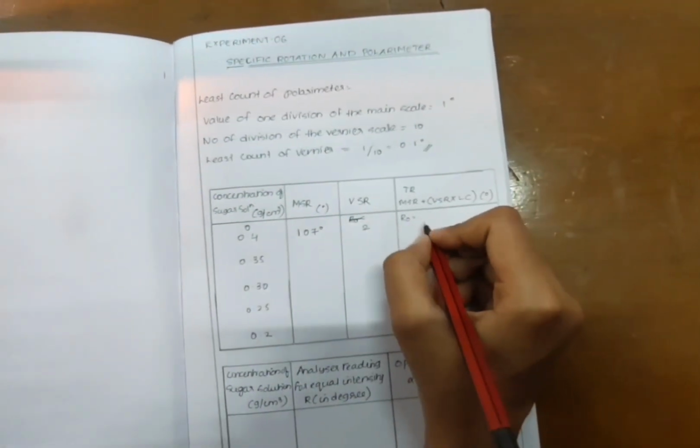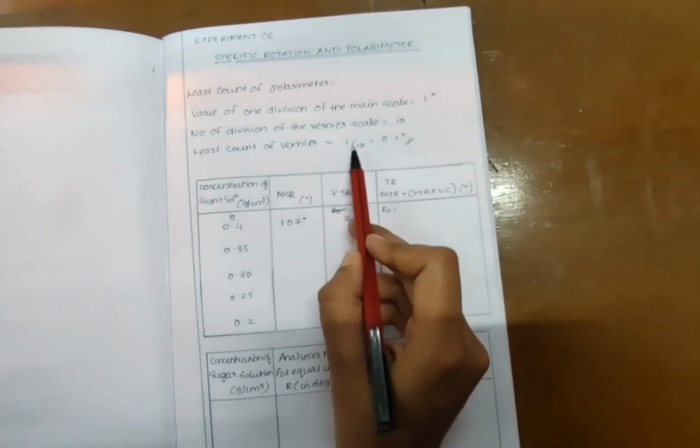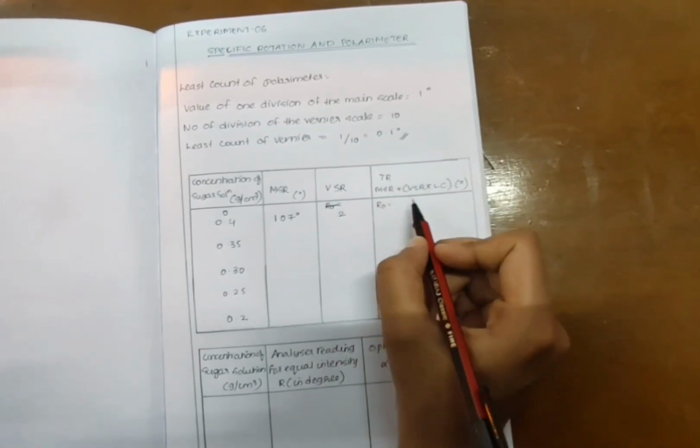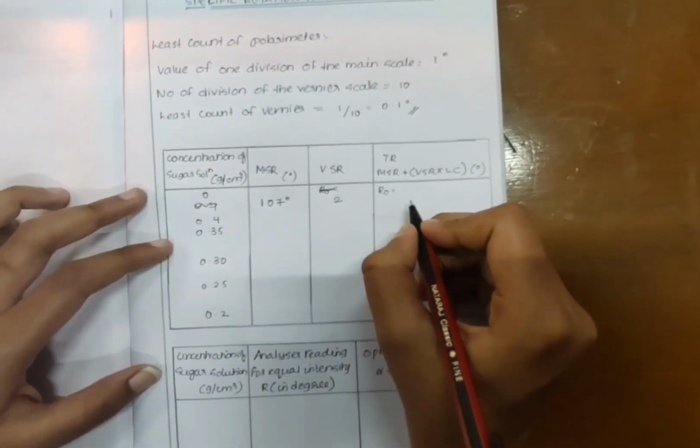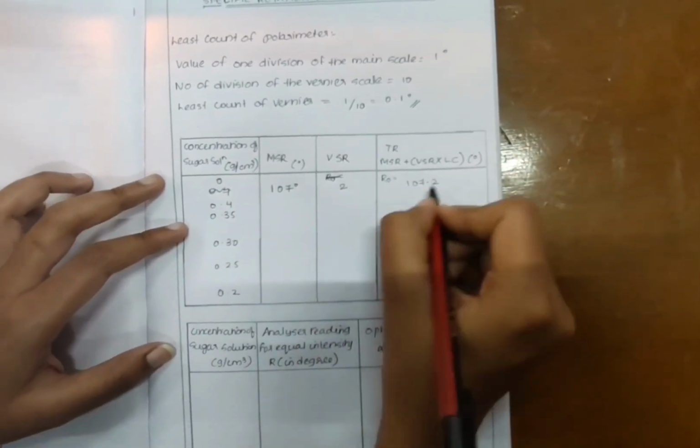So, the total reading will be MSR plus VSR times LC. The LC here is 0.1 degree. So, the R0 value will be 107.2. Now, we have got the R0 value.